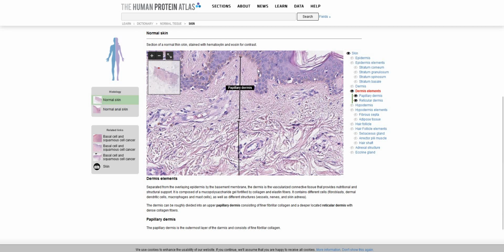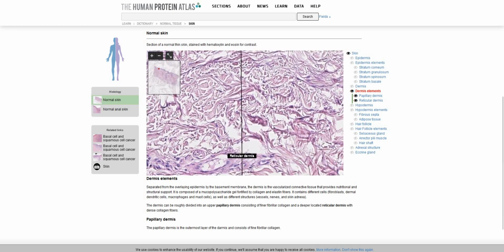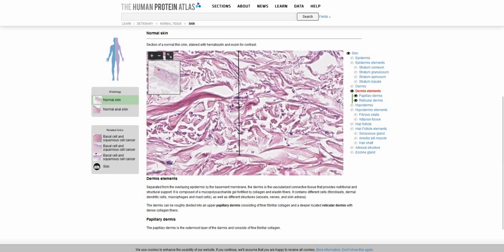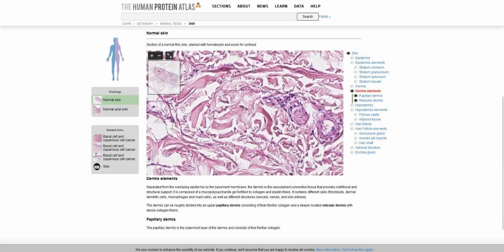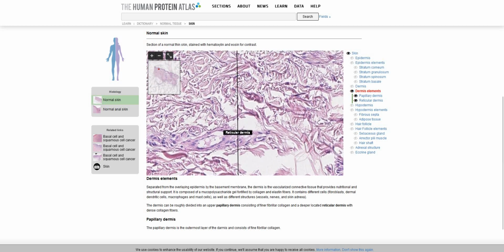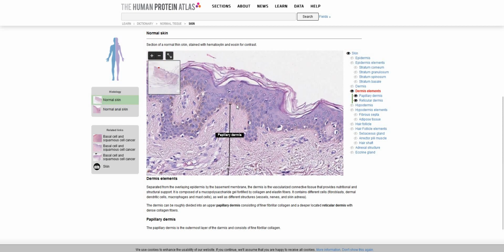And we have multiple types of connective tissue. So we'll talk about what these layers are called next lab, but just look at how much connective tissue there is deep to our epidermis. And it's so varied in shape and appearance. So a lot of today is just going to be sorting through this type of connective tissue and figuring out what all of these squiggles and things mean. So I don't expect you to have a total grasp on this by the end of the video. This is just practice with microscope slides. But we're going to do a lot more of this and keep practicing with it as we prepare for lab exam 1.